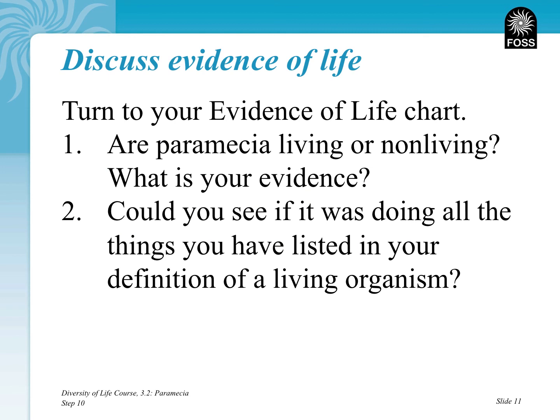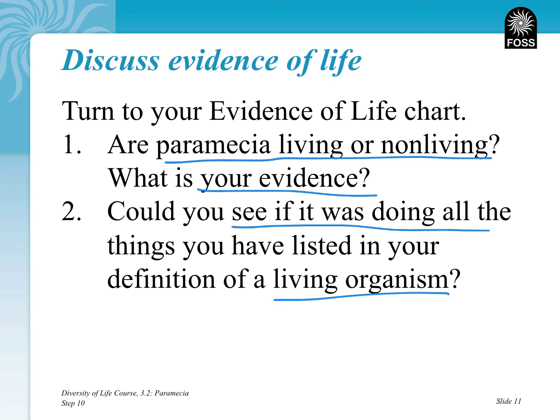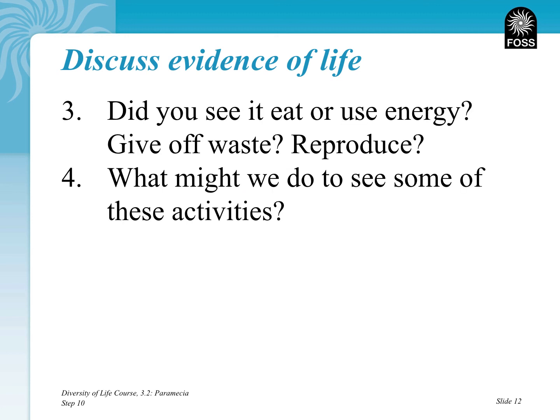Let's now go back to our evidence of life chart. Are Paramecium living or non-living? And what would be your evidence for that? We could probably say that they're moving. We could probably say that some of those things inside of it maybe acted like the Elodea did. And then, could you see if it was doing all the things that were listed by the definition of an organism? We went through those 8 characteristics of life. Were we able to see if it was doing all of those things? That becomes the big question mark. Maybe we need more observations and more evidence to make that determination. It sure looks like it, though.